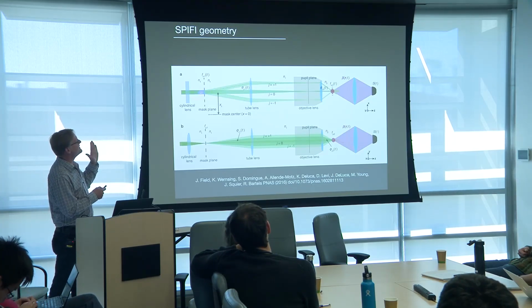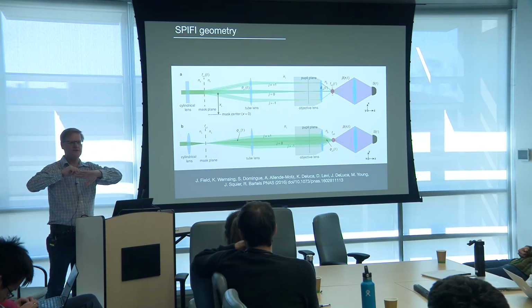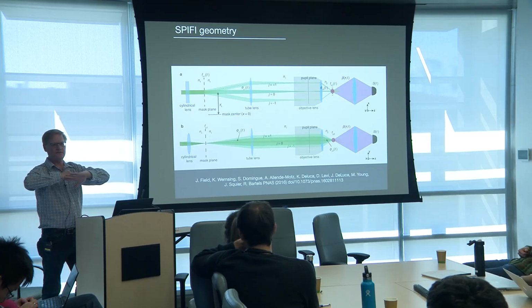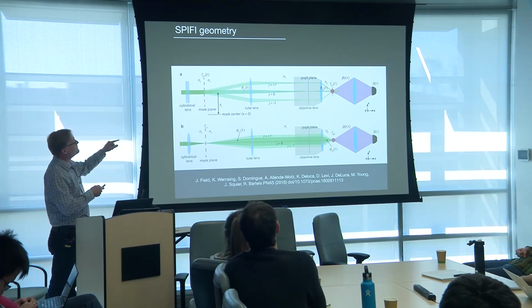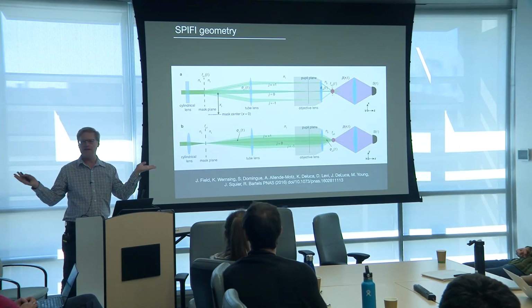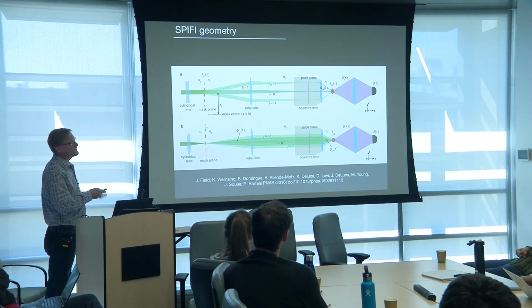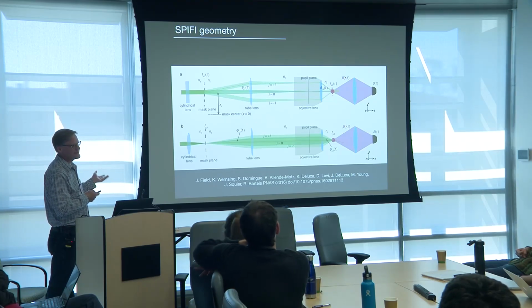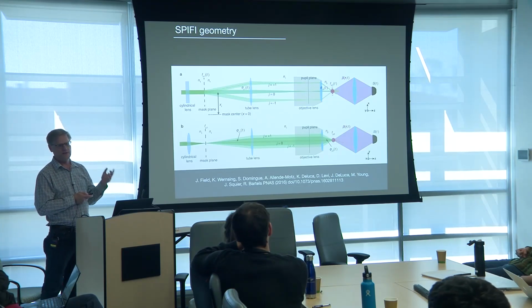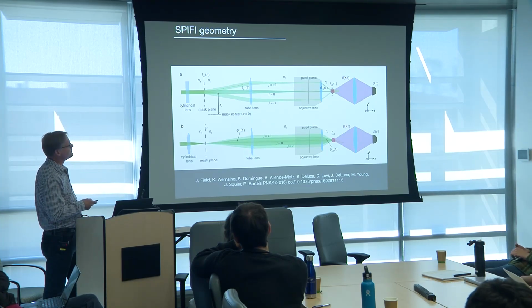And if you think about it, when I take a line and I hit a mask, I've got this modulated beam. That is just the interference of beams coming in at different angles to produce these lines. And so from the top view, as I spin the mask, I really can see these light sheets, and they breathe in and out as the mask is being rotated. And they produce different spatial frequencies as a function of time on my sample here. And I can use anything I want to detect. I can image with the beam itself. I can do linear fluorescence. I can do 2-photon fluorescence, second harmonic, third harmonic, you name it. It works with all of them.